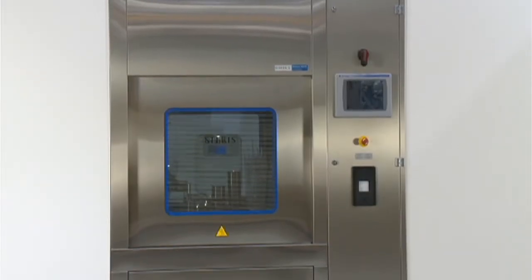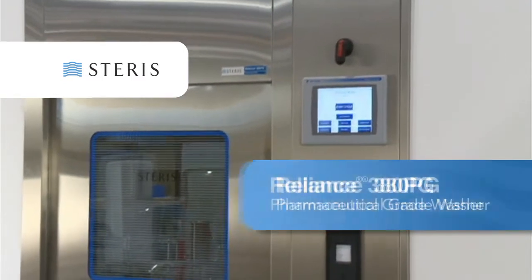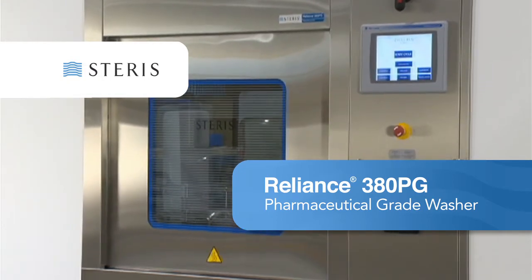Introducing a new high-performance parts cleaning system from Steris. The Reliance 380PG Pharmaceutical Grade Washer was designed to clean critical components commonly used in pharmaceutical manufacturing.